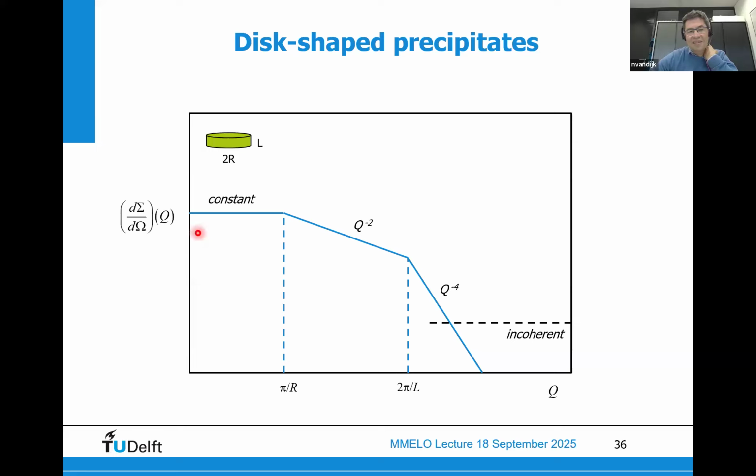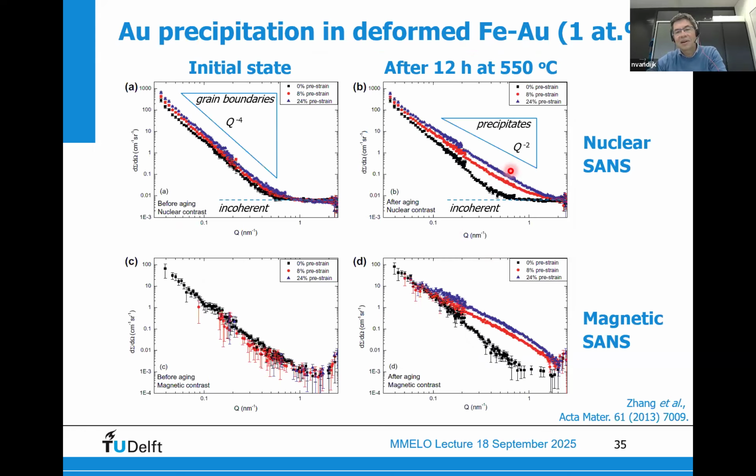And that means that you now have two types of characteristic sizes. We have seen that the scattering is constant below a critical frequency, which is related to the dimension of your sample. But now, because we have two different dimensions, there is also an intermediate region where it is big for one frequency and small for another frequency. That's why we now have 3 different regimes with different power laws. And that's also what you see over here, that we now have a different type of behavior in the intermediate range.